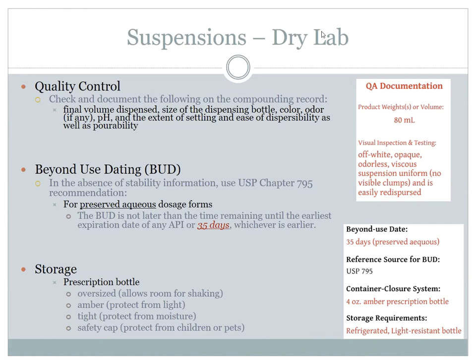Okay. Let's move on to the beyond use state. Oh, one thing real quick, quality control. So we described it there. There are some additional quality controls or QA things you can do. We used to in the past, when we had more time, have you actually test the pH, because when that drug's in solution, or as a suspension, I should say, you can check a good formulation and check to see what pH. And there are other quality assurance things you can do for suspensions. For us, though, we will limit it to the description of your final product.